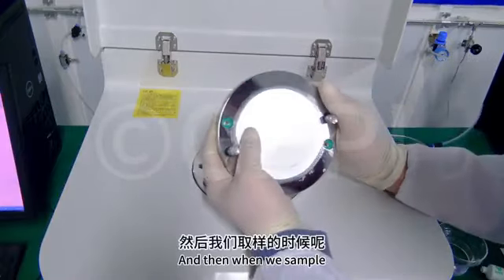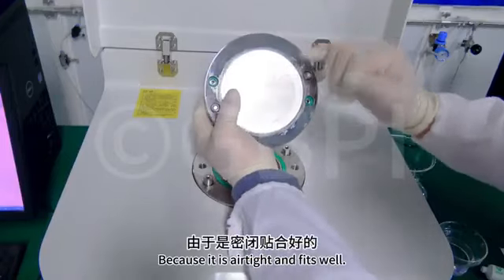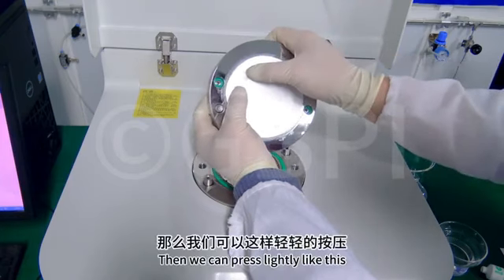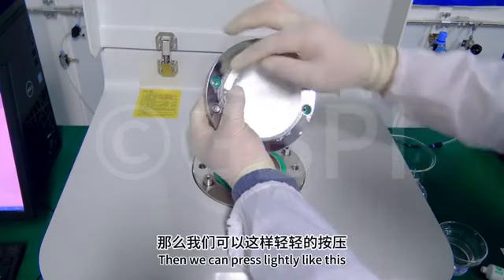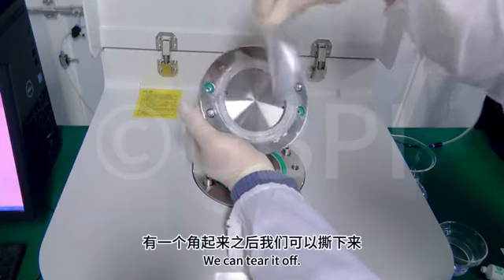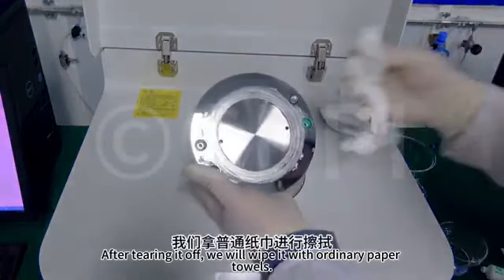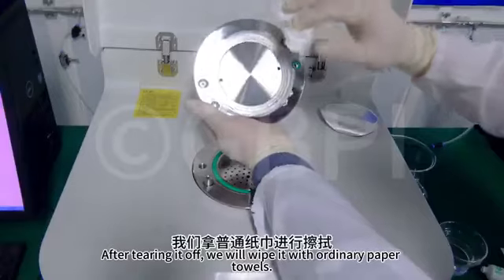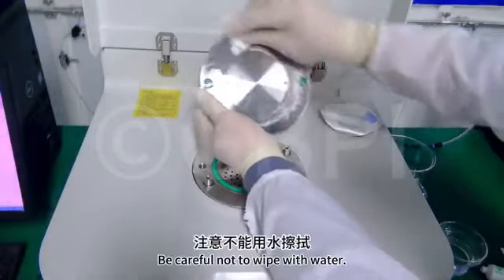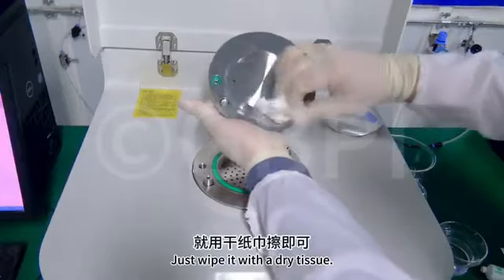And then when we sample, because it is airtight and fits well, then we can press lightly like this. After a corner is up, we can tear it off. After tearing it off, we will wipe it with ordinary paper towels. Be careful not to wipe with water. Just wipe it with a dry tissue.